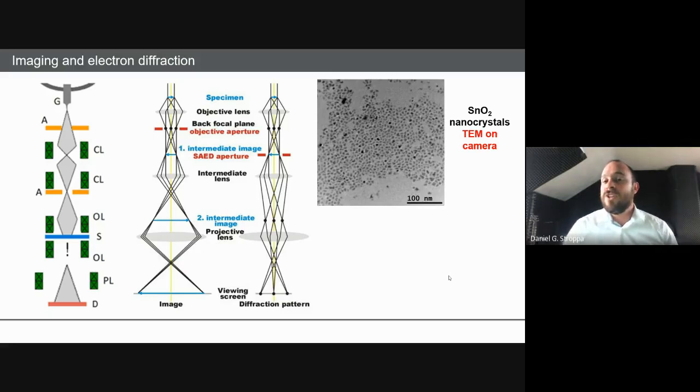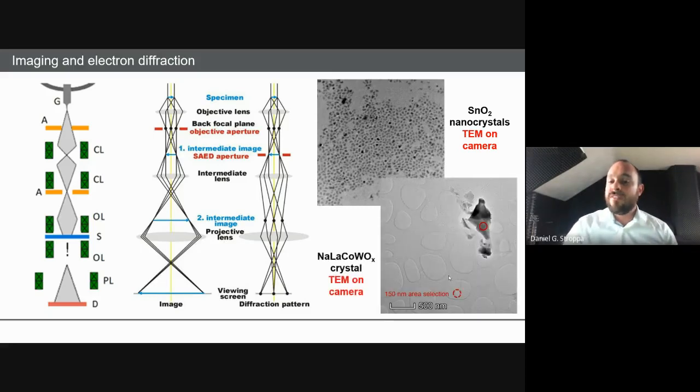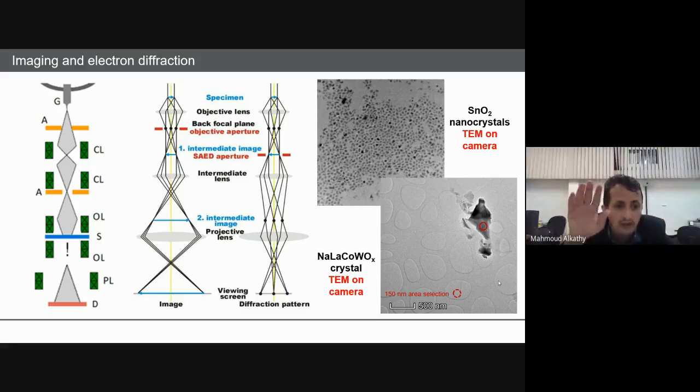Sure. So if you look at a monocrystalline pattern, you can check for the distances here. You take the central spot, the brightest one that you can see very close to the center. You're going to see that it looks like a cubic material, and you have very defined spacings. You have the multiples there. So this will probably be the 100 and so on.